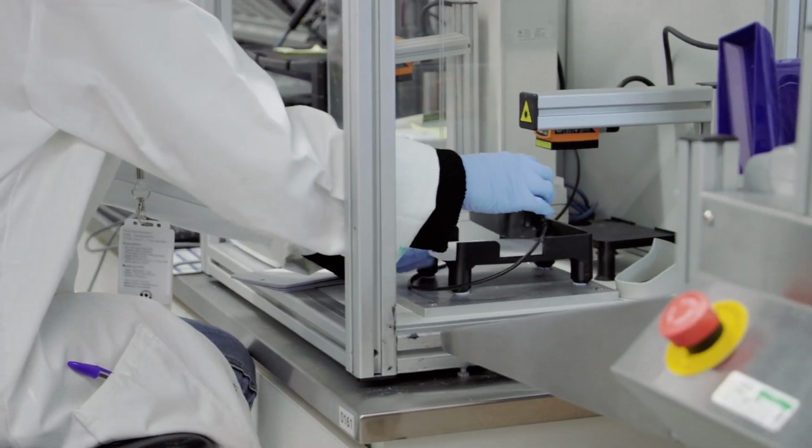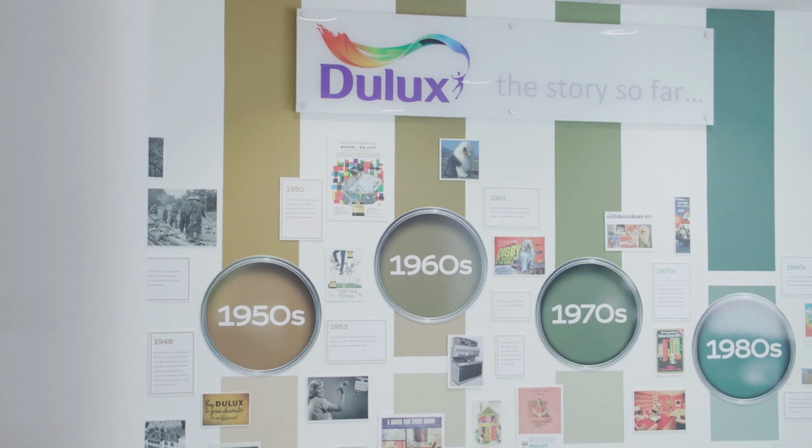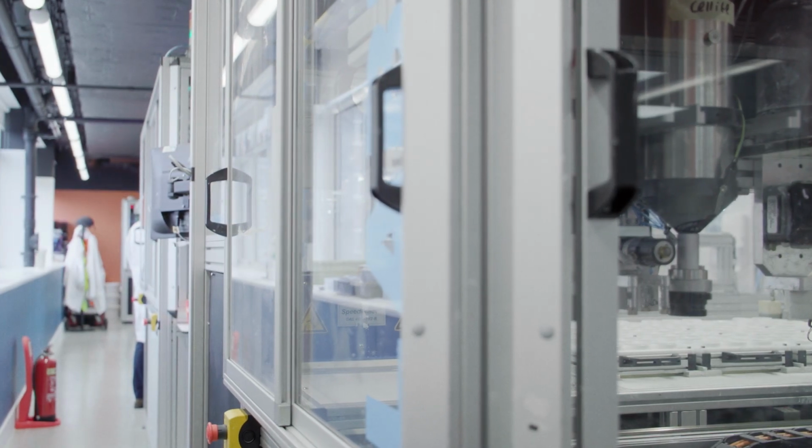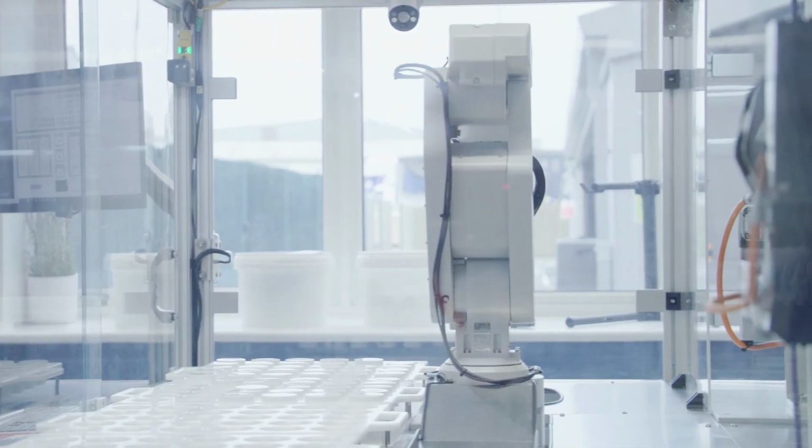I'm Dorian, hi. I've been with Akzo for almost 27 years now. The last 4 of those I've been working with the Labman robots. We have designers who provide us with formulations, and the robots will maybe make 100 or 200 different formulations, small pots of paint in one go.